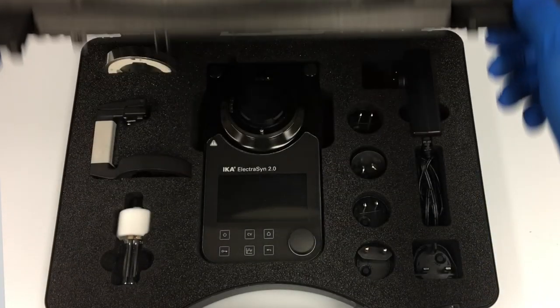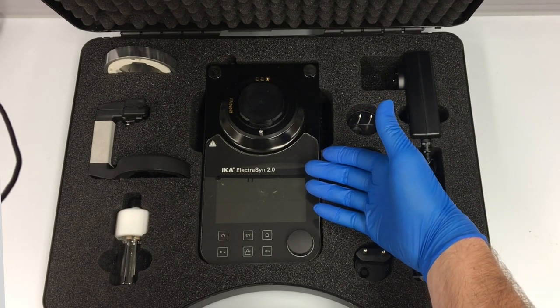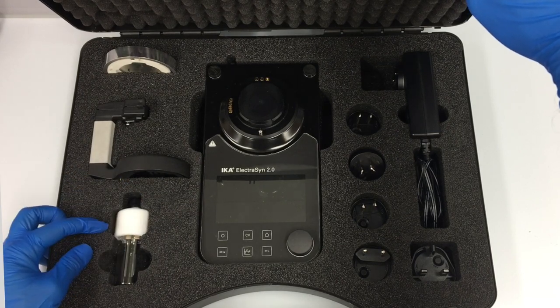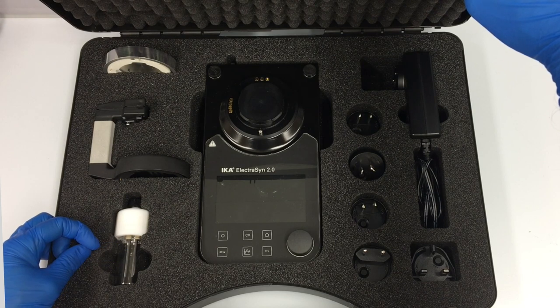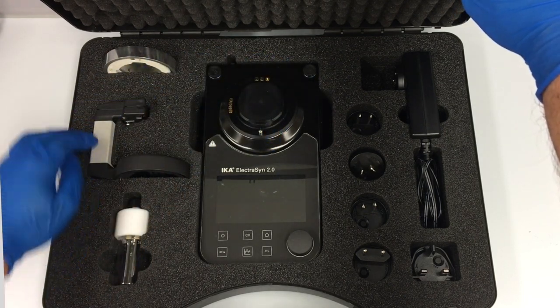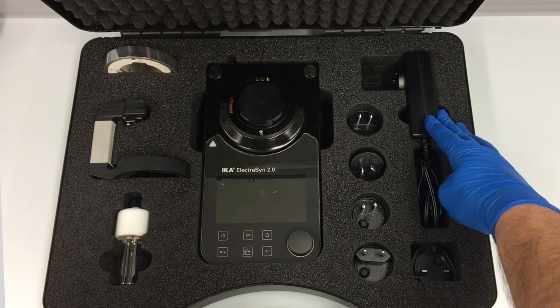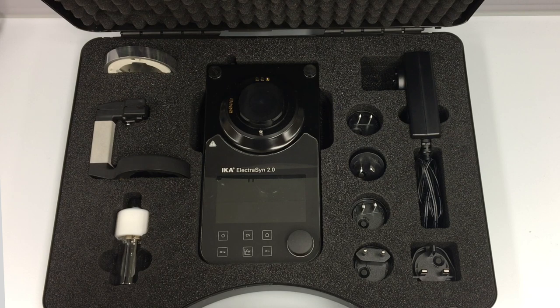Unlatching the latches here, what's included is first the Electrosyn 2.0 main unit. We also have a vial that includes the vial cap, electrode holders, and two graphite electrodes. We have the holster that holds the vial to the Electrosyn and screws on via the bayonet attachment. We have the stir bar attachment accessory, and on the right hand side we have the power supply with a variety of different power adapters depending on where you're going to use the Electrosyn in different parts of the world.